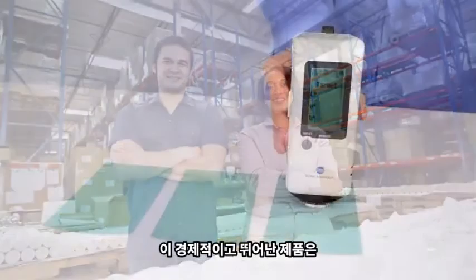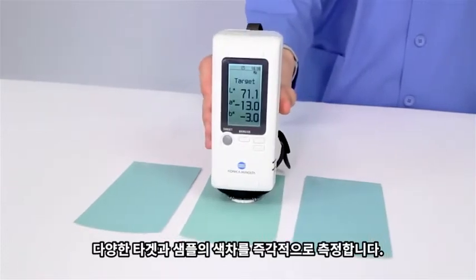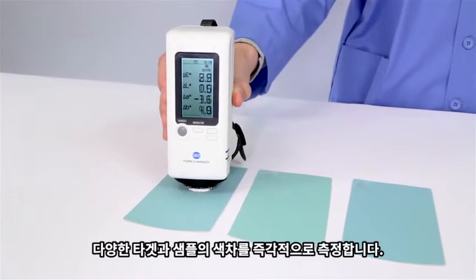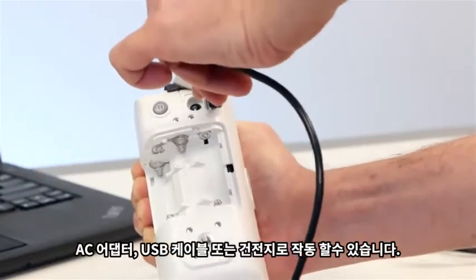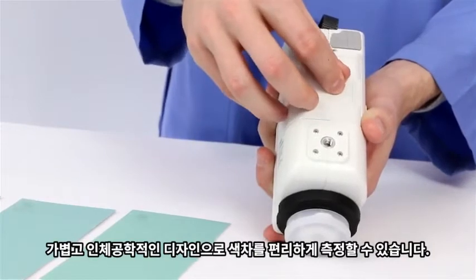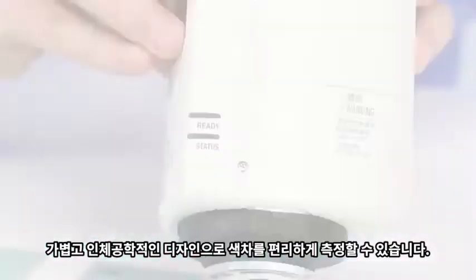With this high-quality, low-cost instrument, you can measure overall color difference between targets and samples in an instant. You can also operate the CR10 Plus with any one of three power sources, including an AC adapter, USB cable, or batteries. Ergonomic and lightweight design allows you to measure color difference with ease.